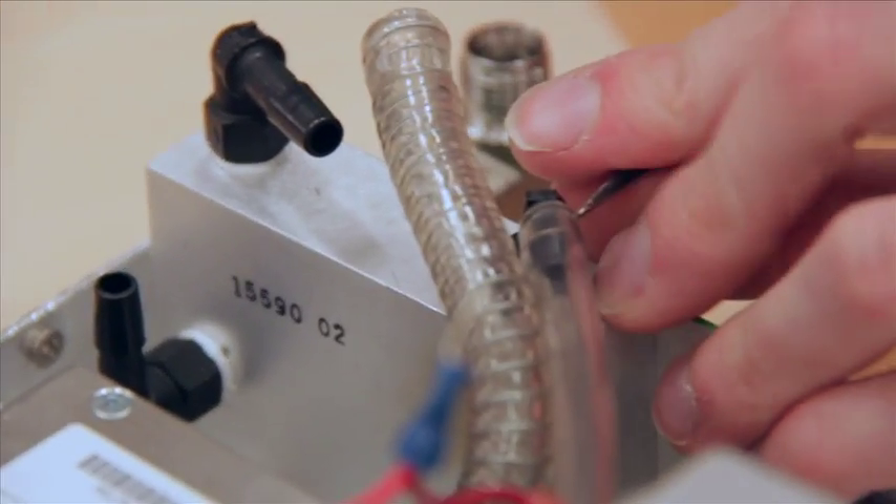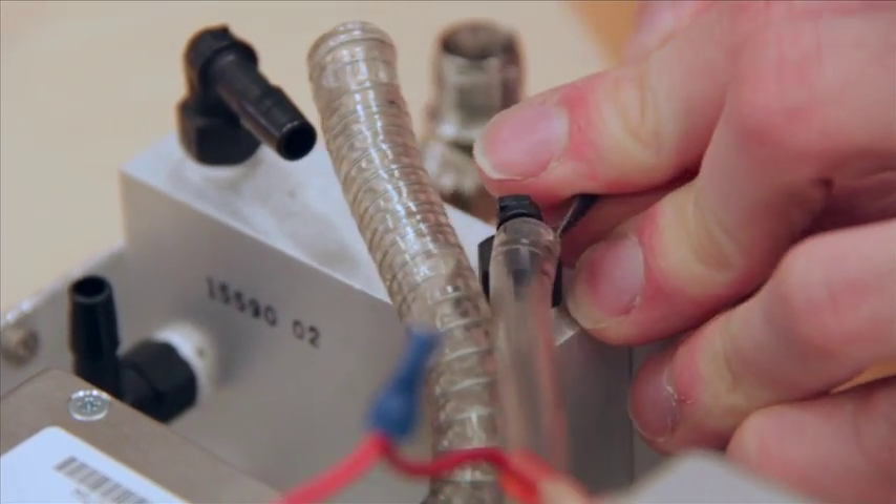And the two smaller tubes, same thing — no clamps though. These are much easier; these just pull off.